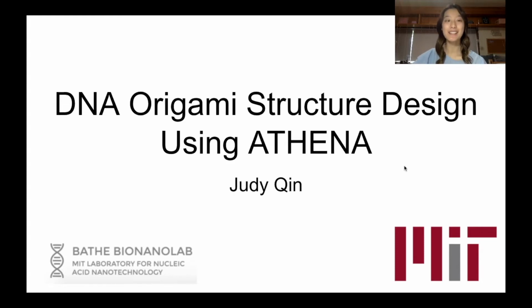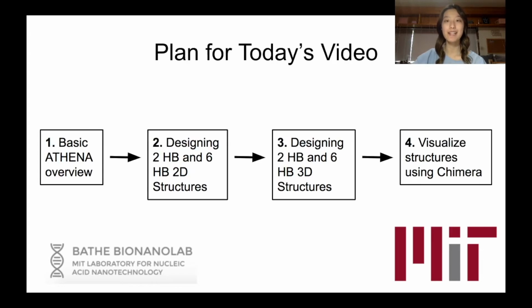Hi, today you'll be learning how to design 2D and 3D DNA origami structures utilizing the already pre-built 2D and 3D shapes that are included with the ATHENA software. The plan for today's video is to first go over a basic overview of ATHENA, then we will design 2 helix bundle and 6 helix bundle 2D structures, then we will design 2 helix bundle and 6 helix bundle 3D structures, and finally we will visualize the structures that we just designed using Chimera.